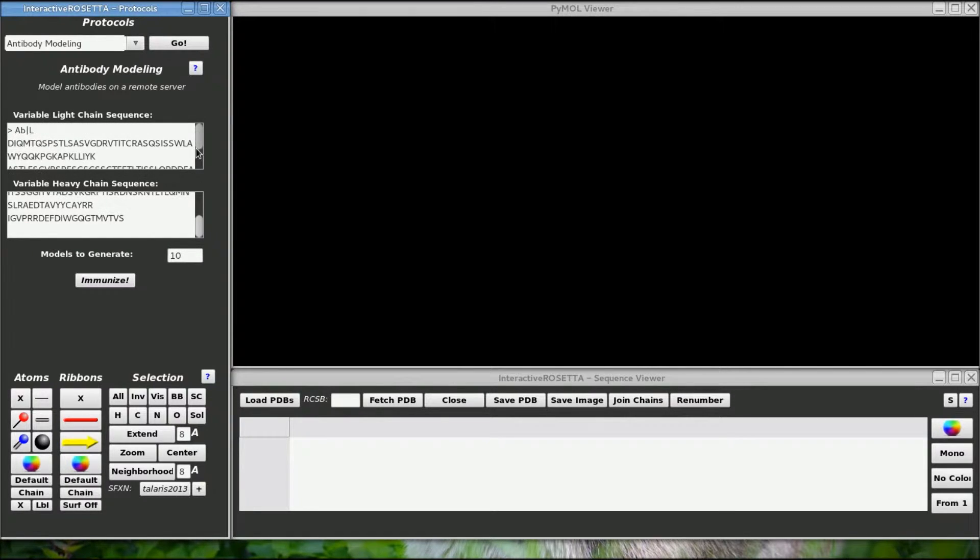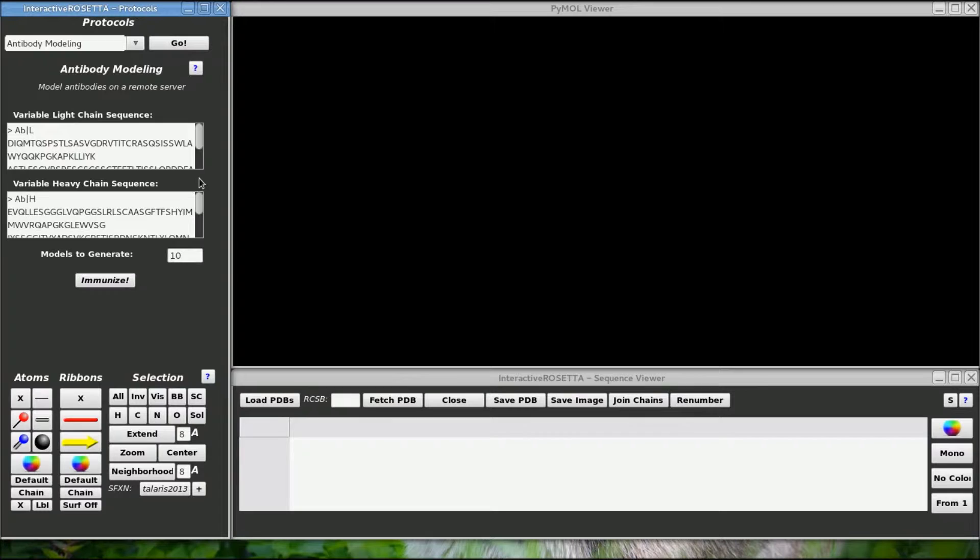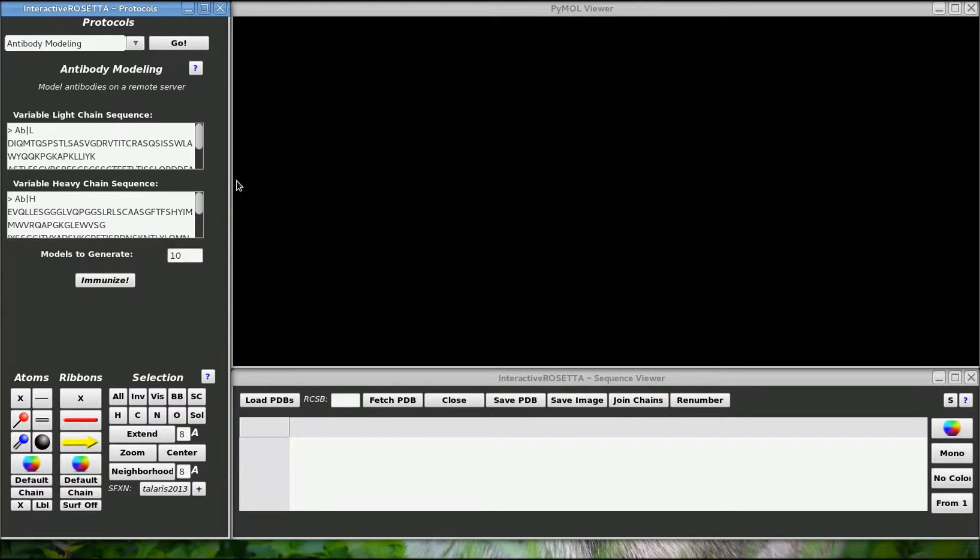Rosetta will only model the variable region of the antibody however. In the past, I mistakenly pasted the whole sequence of an antibody and Rosetta seemed to be able to recognize the constant regions and omit them properly, so if you forget to remove the constant sequences you are probably okay.